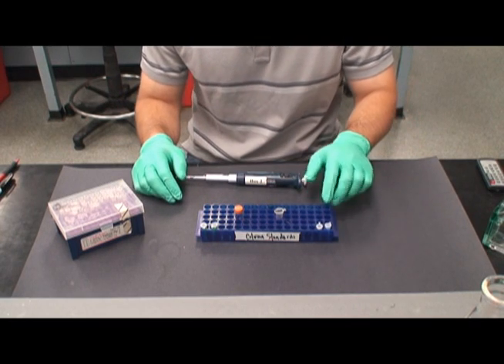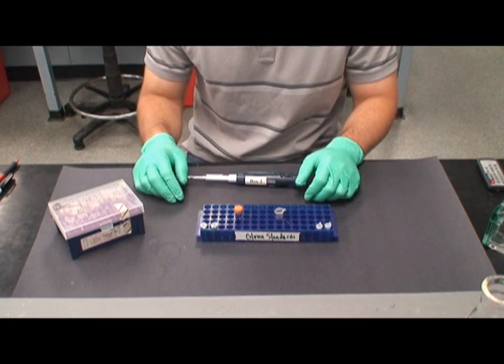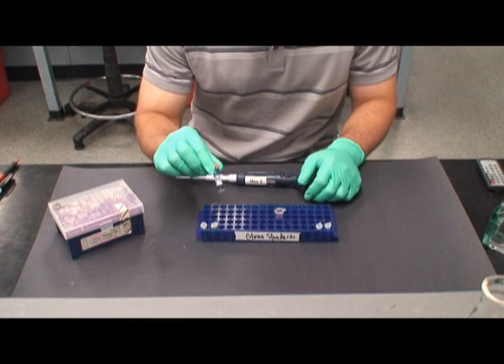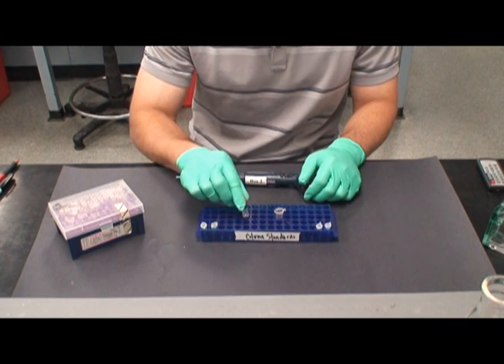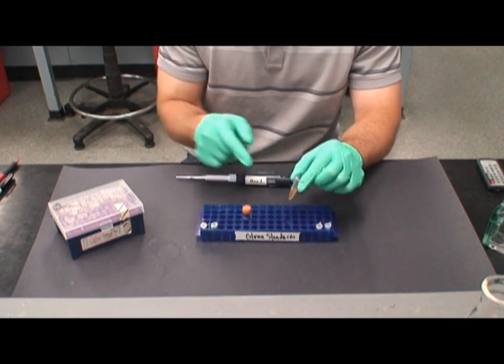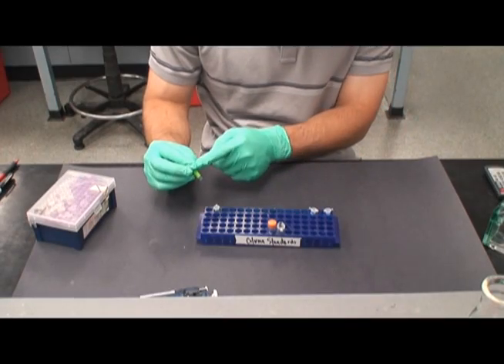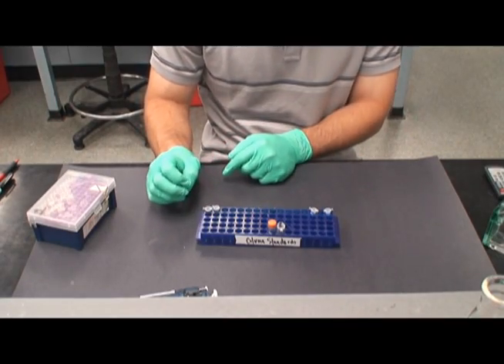Here we have the four microfuge tubes that have been incubated. To each tube, aseptically add 3 microliters of 10x loading buffer and 2 microliters of CyberGreen. A brief centrifuge will ensure that all the liquid gets to the bottom of the tube.